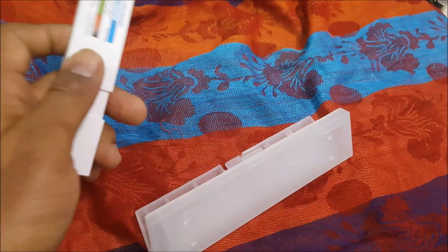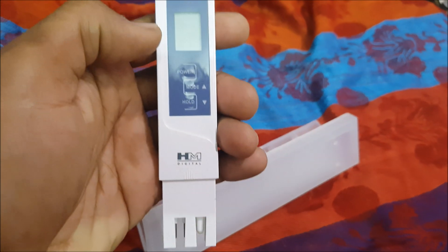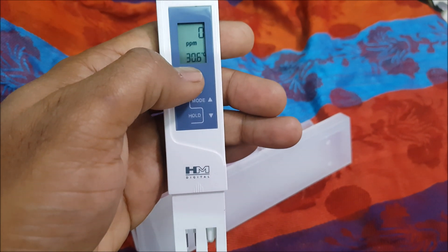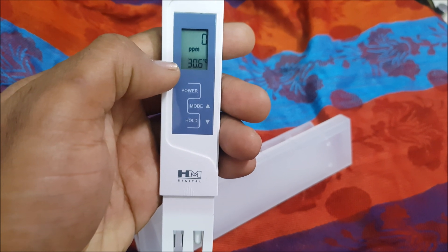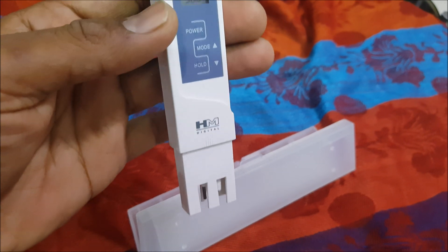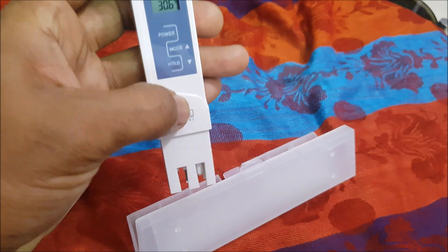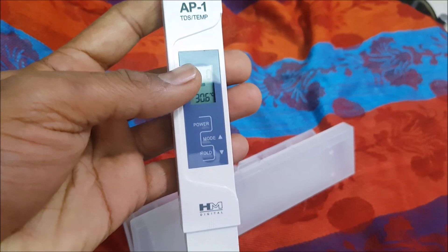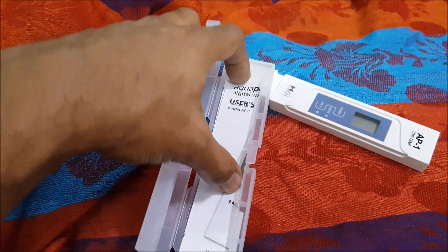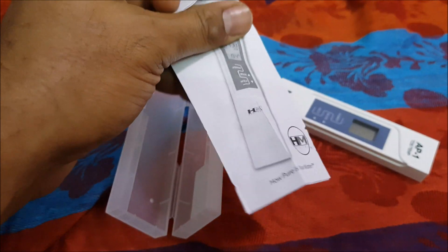This is the product — it has a protective case. After you remove the cover, press the power button; right now it shows zero PPM and below that is the temperature reading. You need to insert this about one and a half to two inches into the water to get the TDS reading. The box also includes a user's manual, which is pretty handy.